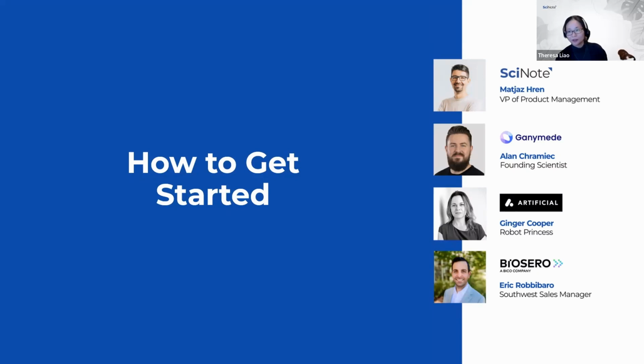And even when we're implementing an electronic lab notebook, that's what we tell people: start with the things that you're doing right now, something small scale, some active projects that you're working on, and then slowly expand it into the whole company. So start with what is critical. And I think that applies to a lot of things as well. Ginger, do you have anything to add? How do people get started?